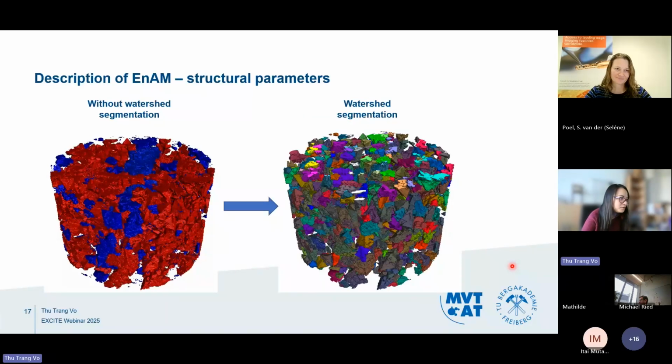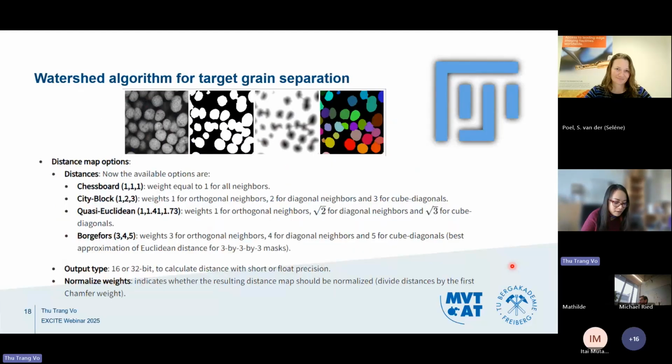And I also looked into this, since fragmentation is a purely mechanical way to induce some changes into your sample. And these mechanical changes now are on an image and might be processed in a non-physical way.